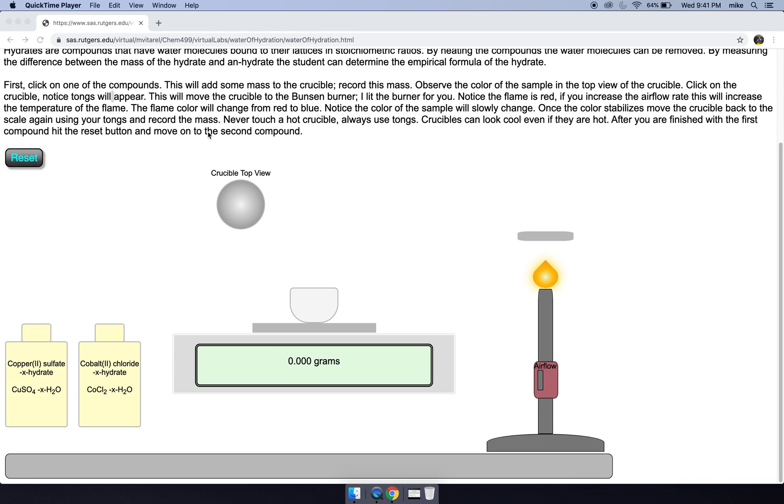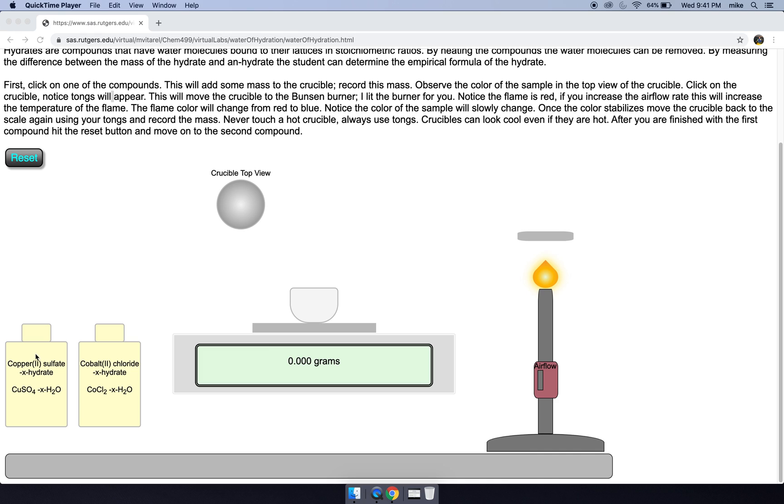So basically we have these two hydrates. You'll click on them and some mass will appear in this crucible, and you'll see a top view of the crucible here and it'll read 1.00 grams. So let's try the first sample, this copper 2 sulfate.